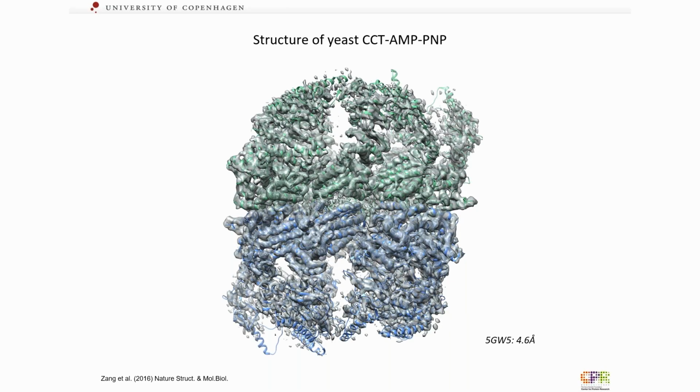This is the cryo-EM map of yeast CCT, which you can see in the central part, and the conserved equatorial domain fits quite well with the density, but the apical parts cannot fit quite as well, because the apical domains are quite divergent and flexible, which also fits their function of recognizing lots of different substrates, capturing them quickly and releasing them quickly.